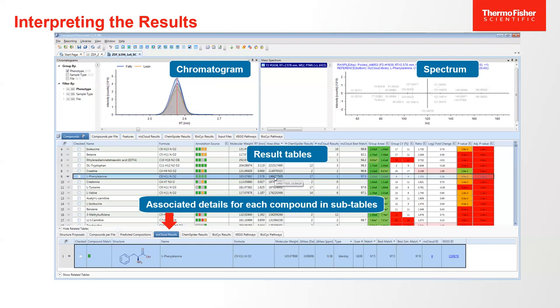So we are going to produce thousands of features, maybe tens of thousands or hundreds of thousands. A feature is just an m/z over time that creates an LC peak that has a shape which looks believable. It would not embarrass a chromatographer.